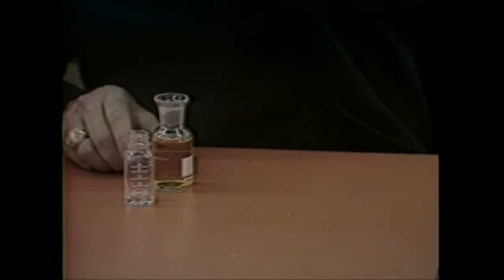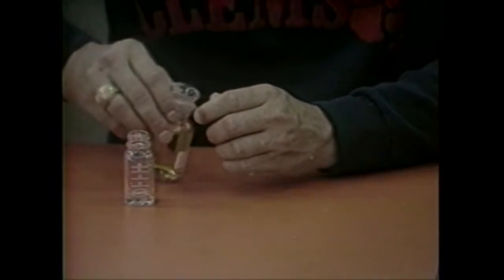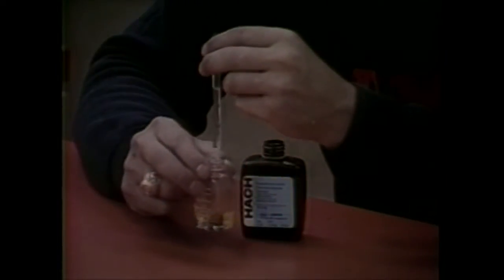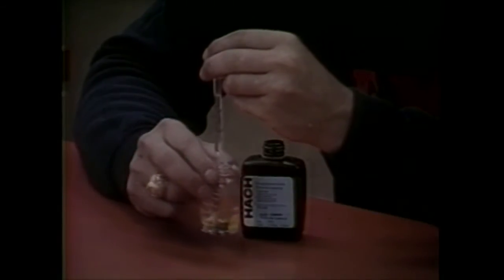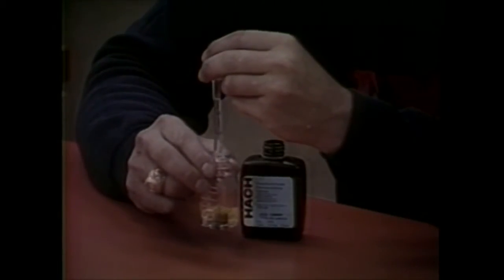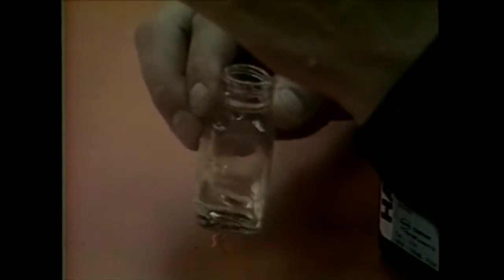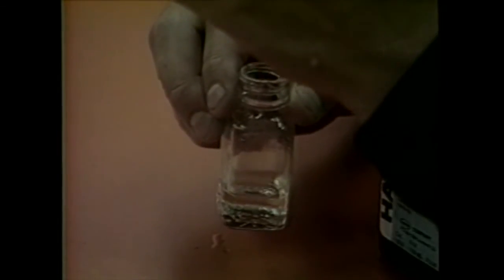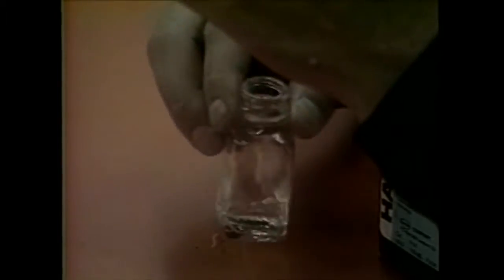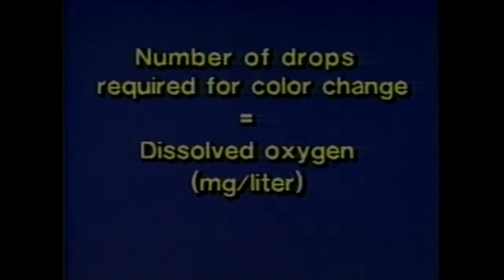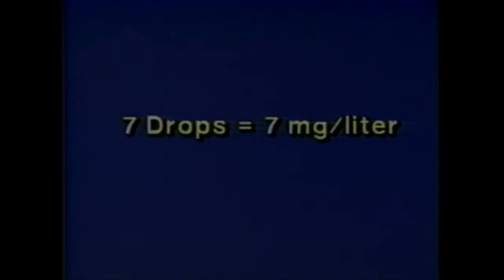Rinse the plastic measuring tube with the sample, then fill and pour the contents into the mixing bottle. Add PAO standard solution drop by drop to the contents of the mixing bottle. Swirl the mixture after adding each drop while dispensing the drops with the dropper directly above and vertical to the mixing bottle. Add until the color changes from yellow to colorless. Be sure to count the number of drops while adding them. The number of drops required to change the sample from yellow to colorless is equal to the dissolved oxygen concentration in milligrams per liter. For example, if it took seven drops for the color to change, then the sample contains seven milligrams per liter or parts per million of dissolved oxygen.